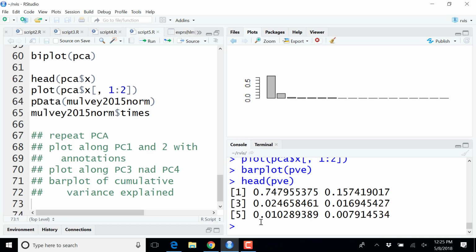And PC1 is so high, and PC2 is so high, you might want to use them, but if they co-localize on top of each other, then that would be... So your principal components will be orthogonal to each other. So it would be very weird to get something like this, PC1, PC2, and have valid points like this. It would be weird. But sometimes what you get is you don't get good discrimination.